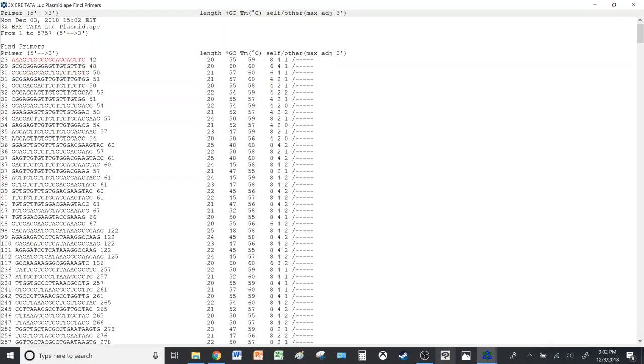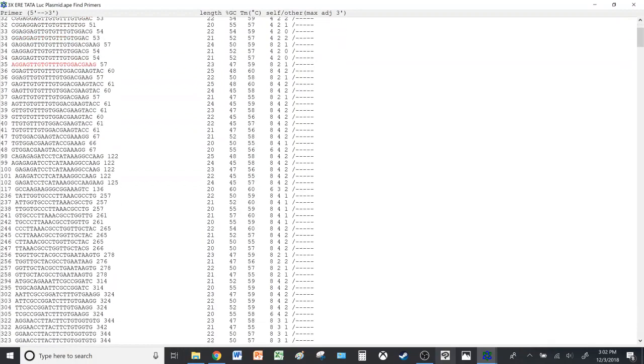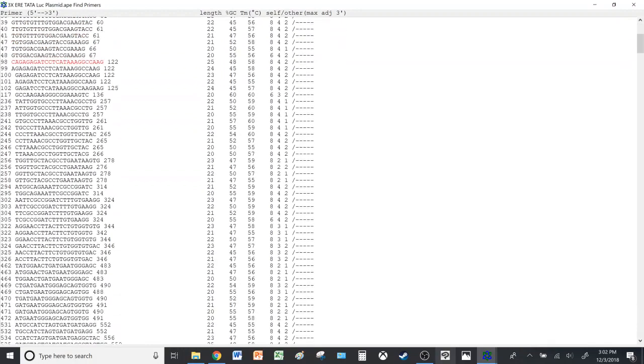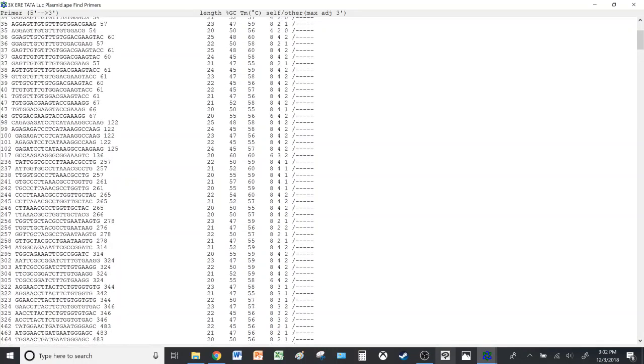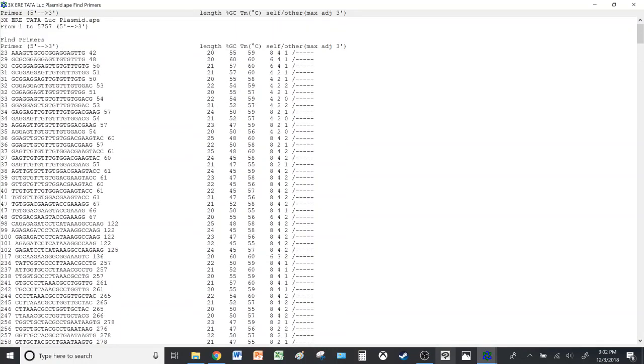So here you get the primer sequences, the five prime to three prime from starting point to ending point. Here you have the length of the primer and the GC content, which affects the annealing of the primer and the melting temperature as well.